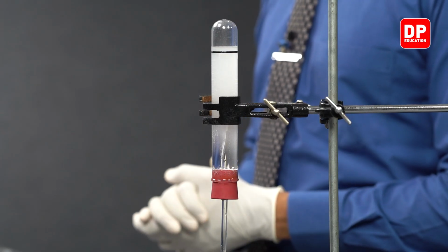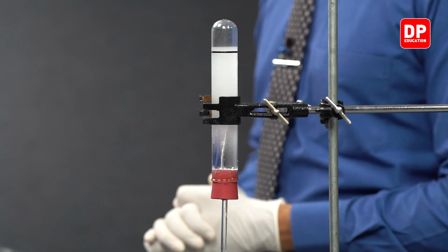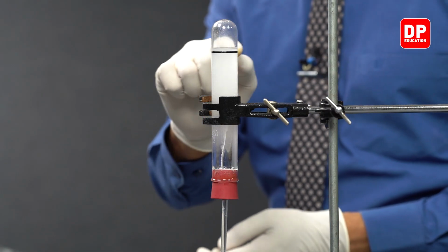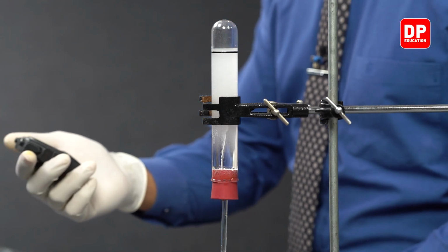Now, students, it has been 5 minutes. We are getting close to filling hydrogen all the way down to this black mark. So we'll stay prepared to stop the stopwatch.